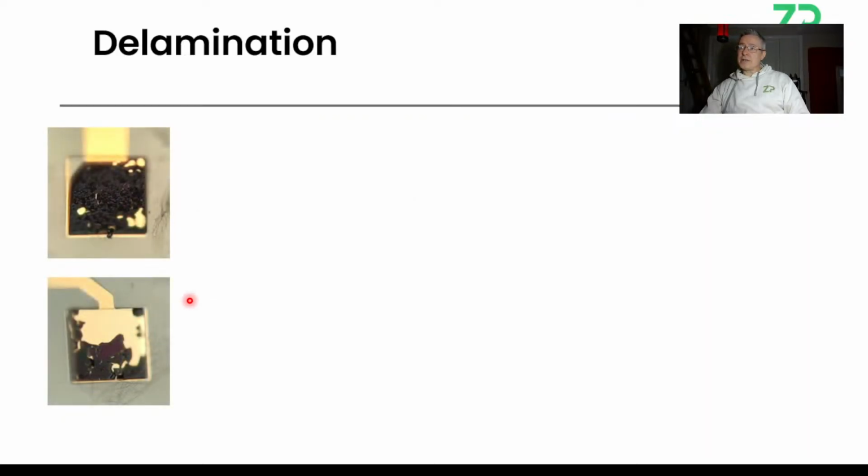So they're putting that down. Now, what they're getting is delamination. The reason you can get delamination is that they've got a gold electrode. It's super smooth, I suspect. I can tell it's super smooth because I'm feeling that it's actually quite shiny.